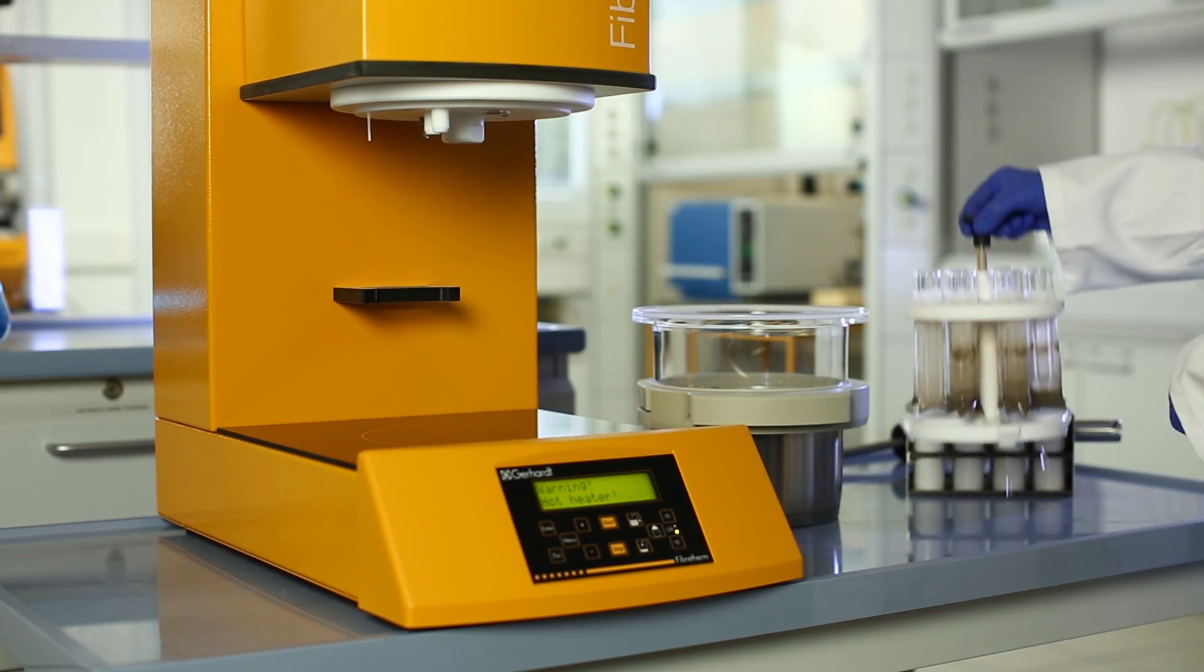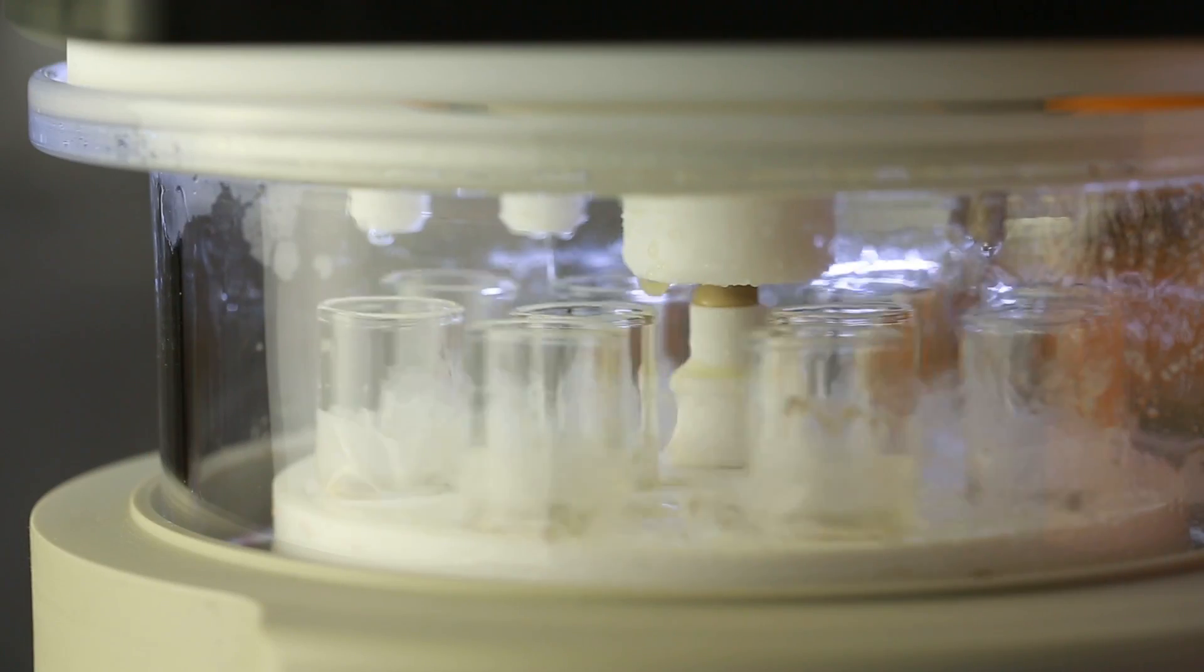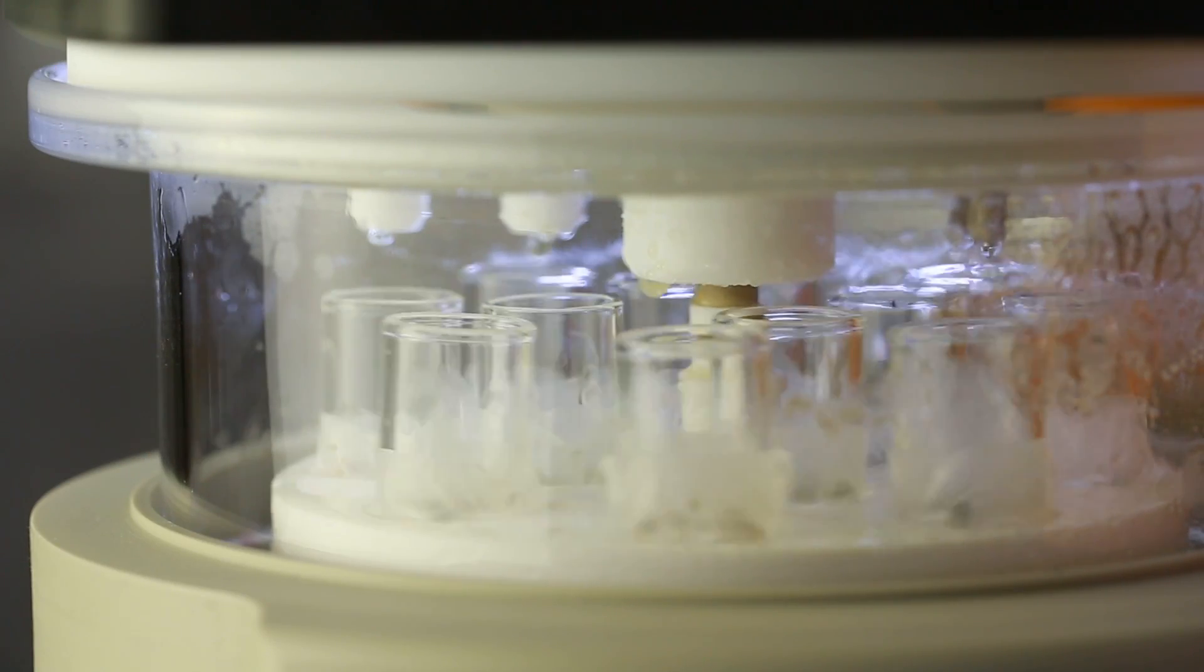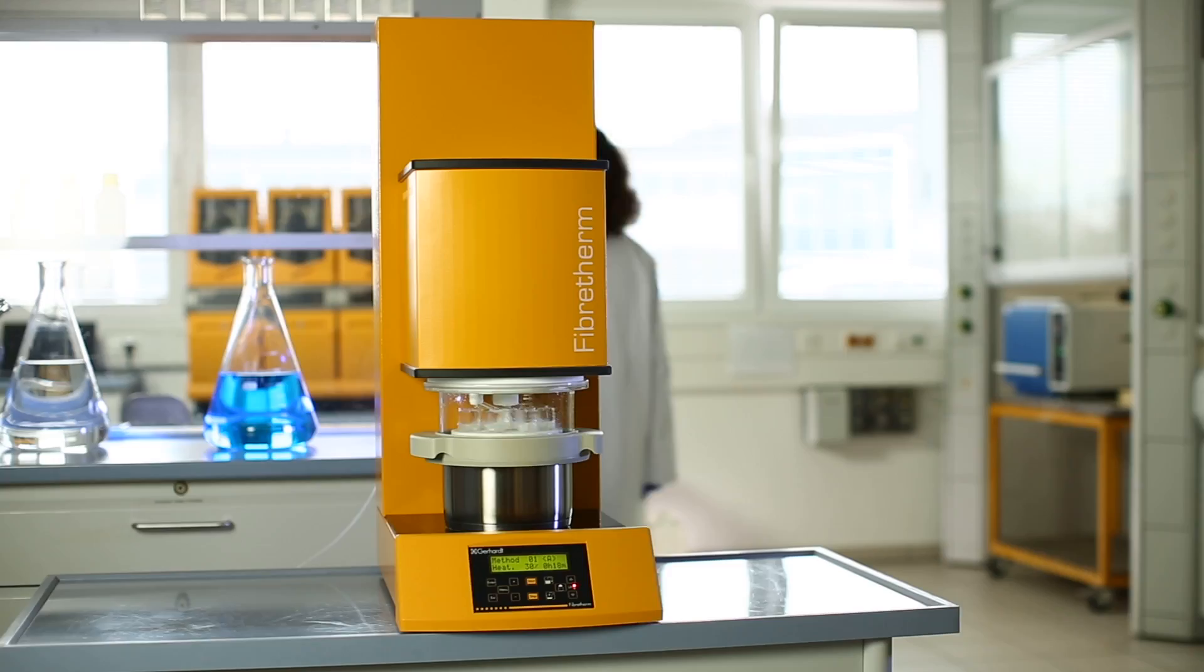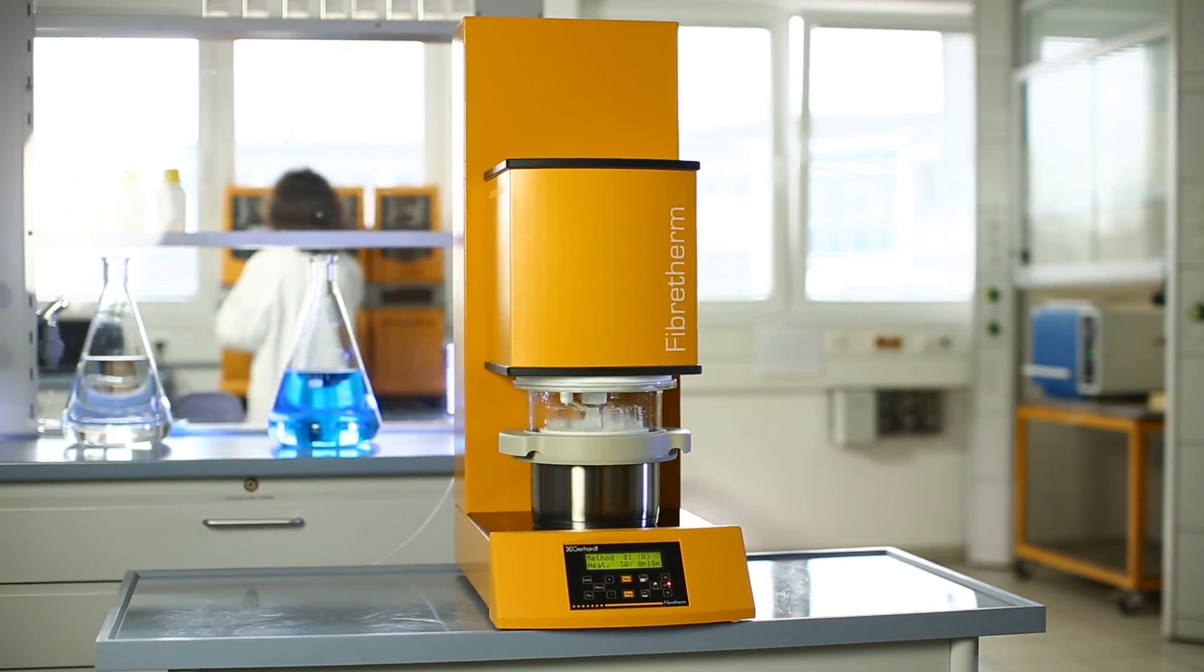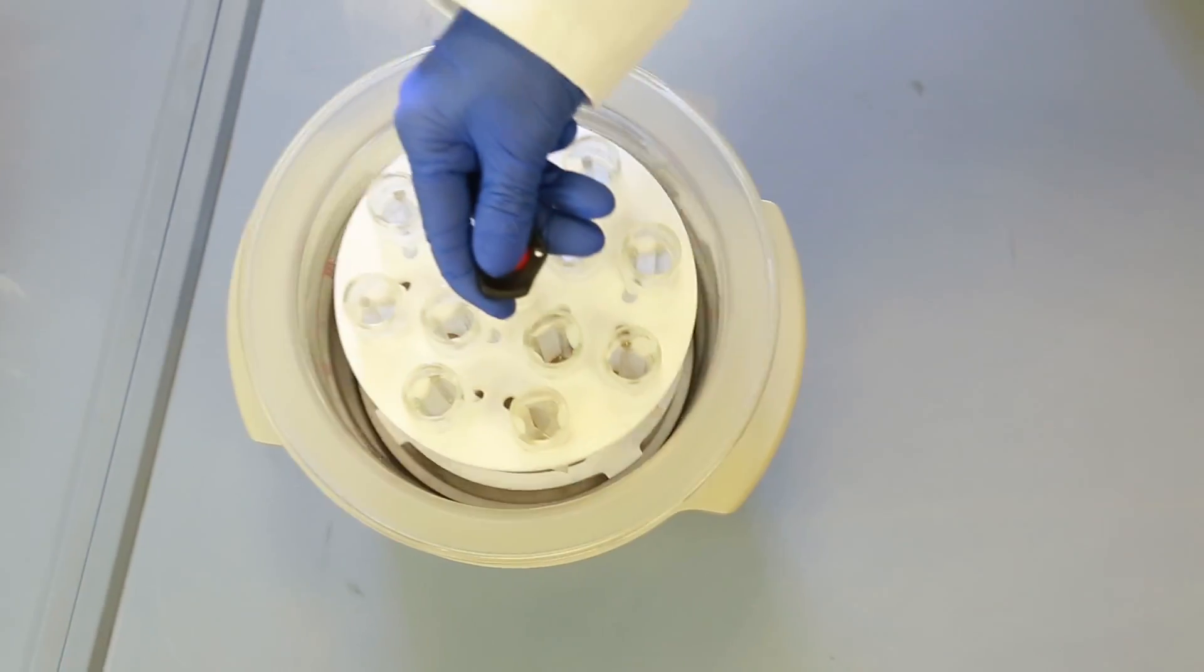Up to 12 different samples can be worked on simultaneously using fiber-therm. This not only saves you money on chemicals and energy, above all, it saves you time. Time which you could be using for something else.